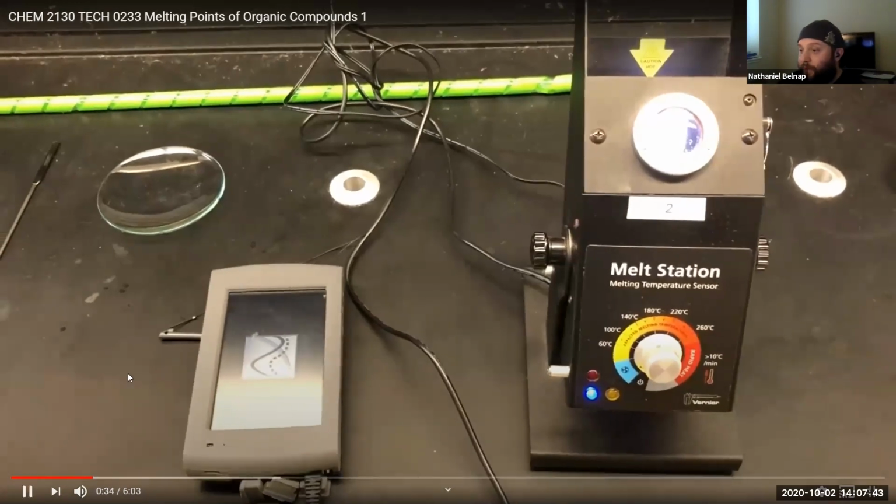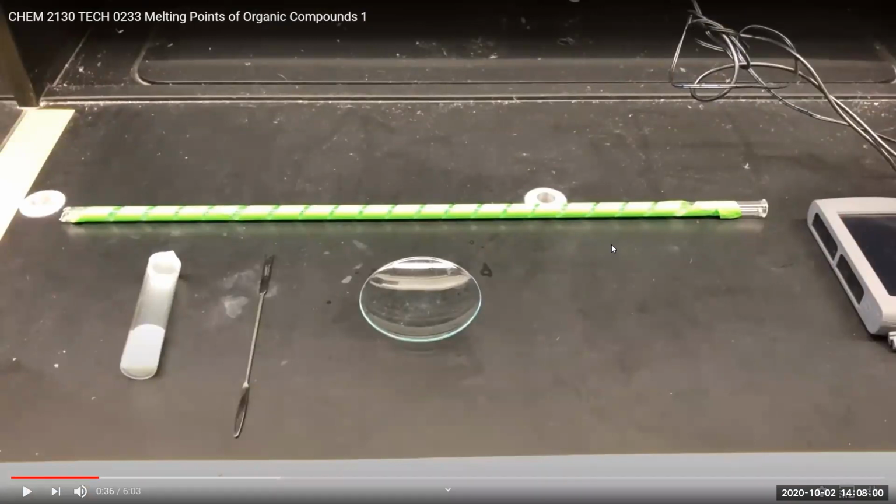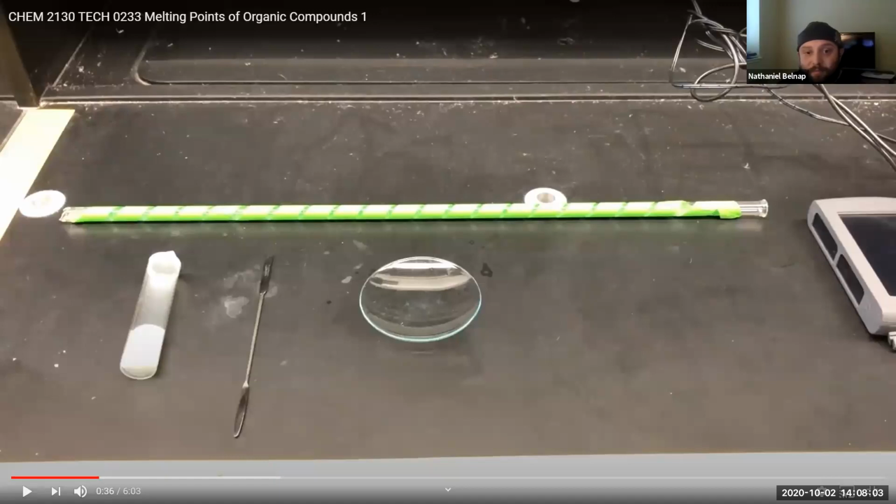So you have it set up. Does anyone know what this big, long, green rod is for? No? Well, in the lab, we're going to use it to help pack the little glass tube. Sorry, this is Laura Burgess. I don't have a camera. That's fine. But anyway, exactly. It's used to pack the capillary tube. You have your spatula and your capillary tubes here on the left. Can you guys see the little mouse I have over the screen? Okay.